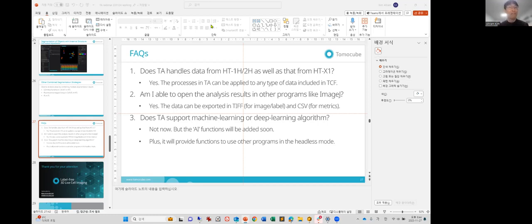And actually, we are developing the feature, so we are not ready to release the mitochondrial segmentation pipelines at the moment. At the same time, we are also thinking of a machine learning process for mitochondrial segmentation and other supervised learning algorithms. We were successful in getting mitochondrial segmentation using Ilastik, and we are incorporating the features.